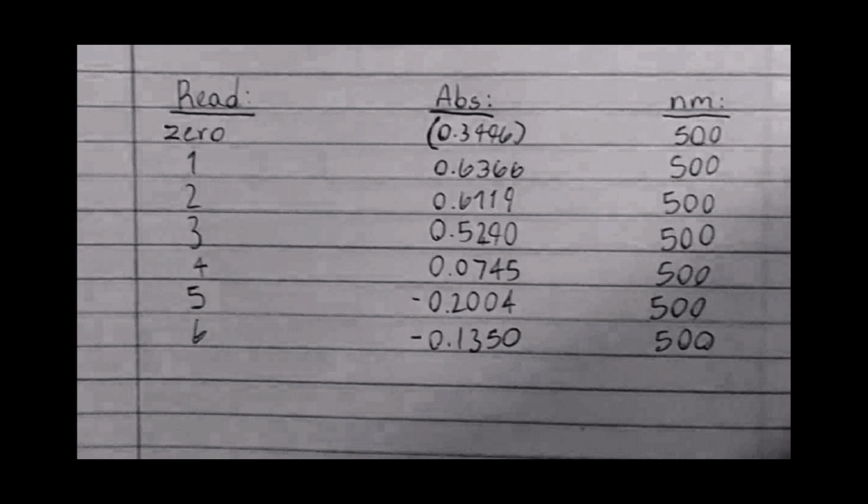Here is our data from the spectrophotometer. Under red we have our 0, our dilution 1 through 3, our 2 randoms, and our pure. The more we diluted, the less our substances were able to absorb light, which is why our numbers are changing here.